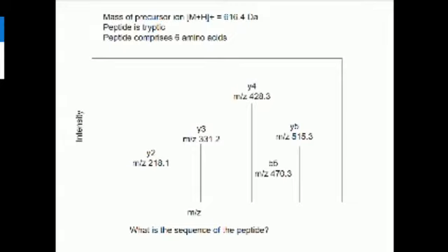There are isomers, and mass spectrometry can't, not just on the basis of mass anyway, tell the difference between two isomers. So we don't know. It could be isoleucine or it could be leucine. So we have to put both here. Okay, it's one or the other. Right, and then we're missing a Y1. So now we've got a problem.